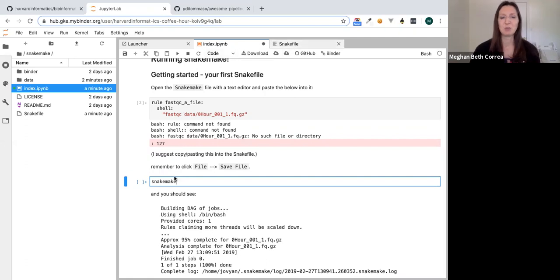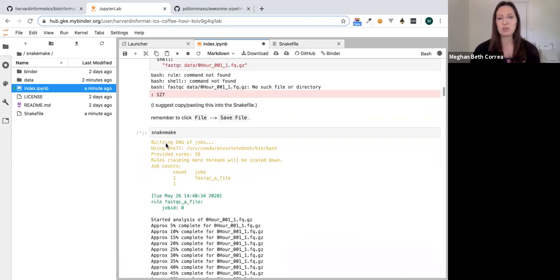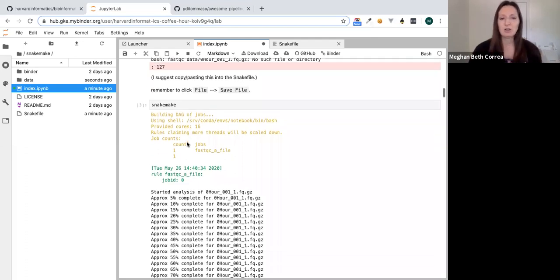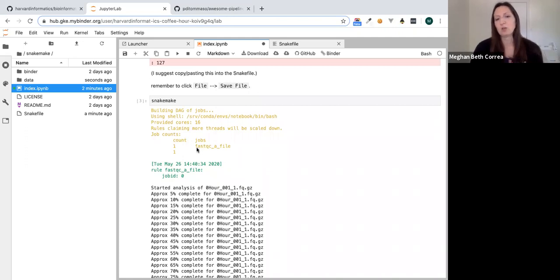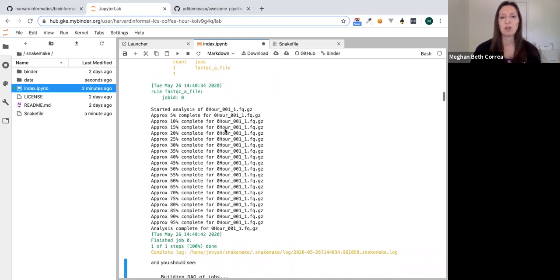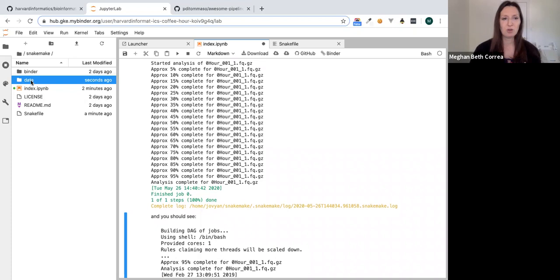We've got a Snakefile, we saved a rule in there, so let's run Snakemake. The first thing it tells us is it's building a DAG of jobs — DAG stands for directed acyclic graph. This is how Snakemake determines and manages dependencies, creating a tree and deciding what it needs to run. Here it only finds one thing to run: the fastqc_file rule, and then runs that bash command. This is the output from the FastQC job, and we see it completes.